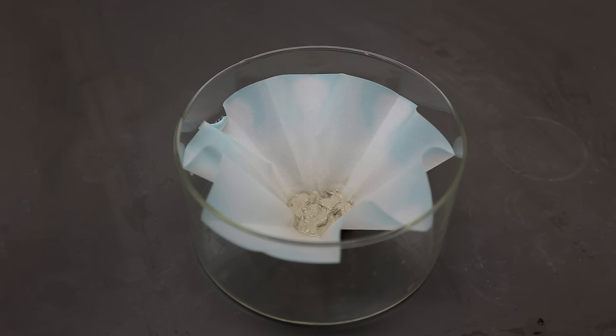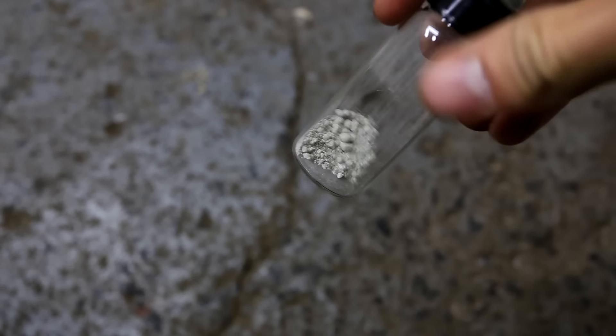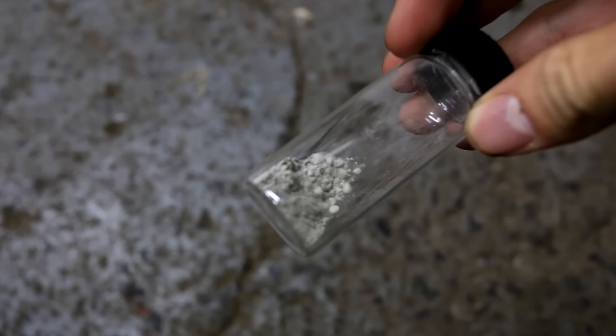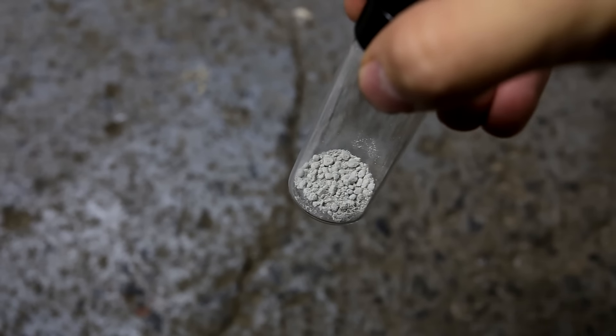The filter paper after draining was then removed, placed in a crystallizing dish, and dried in an oven. This is what the silver looks like when it is dried — it looks like a nondescript grey powder, which is quite different from the metallic silver that you normally see.